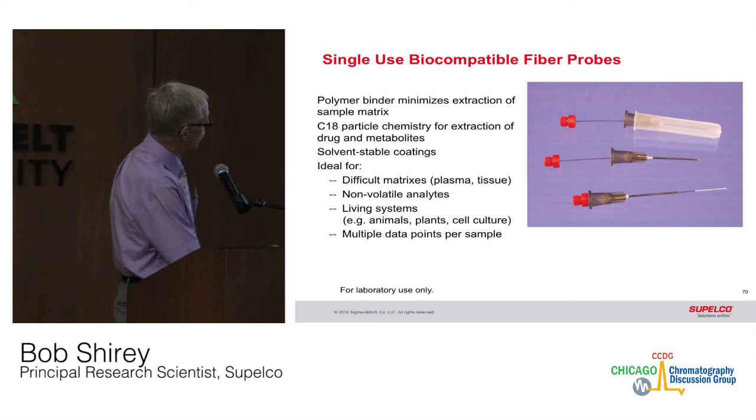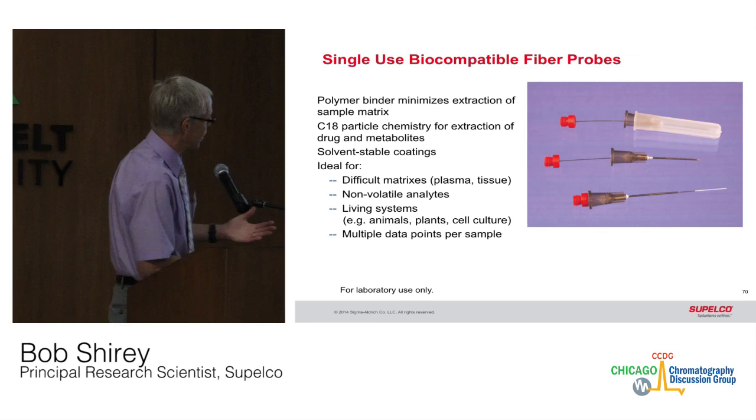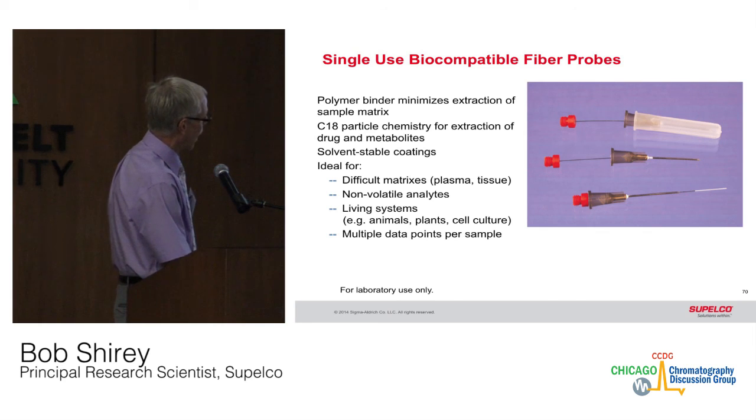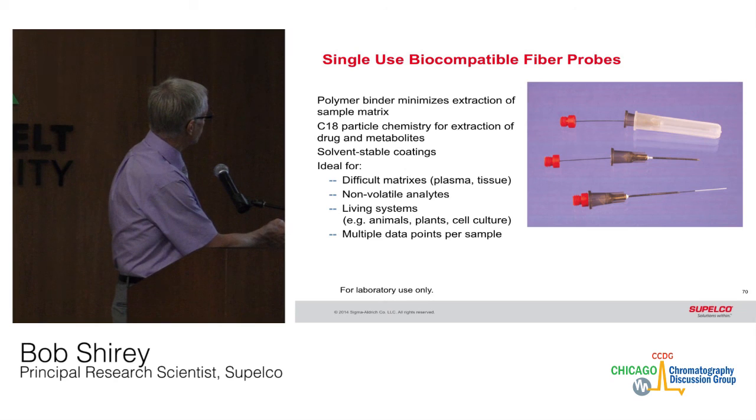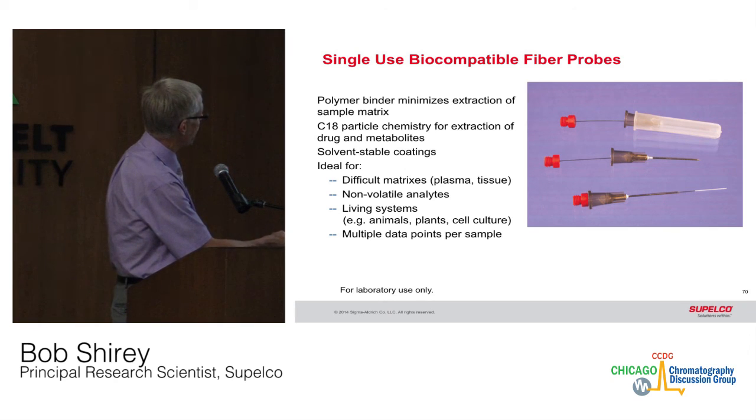It's about 7 centimeters long. It has a hub attached to one end. It's put in a 22 gauge hypodermic needle and sealed with caulking. And that alone can act like a holder and fiber all in one. So you can put this into samples and extract out of vials. You don't need to seal them since we're working primarily with non-volatile analytes. But it can also be put into difficult matrices such as living systems, animals, plants, cell cultures. And in some cases, we can get multiple data points.